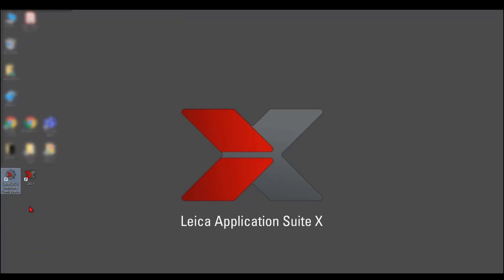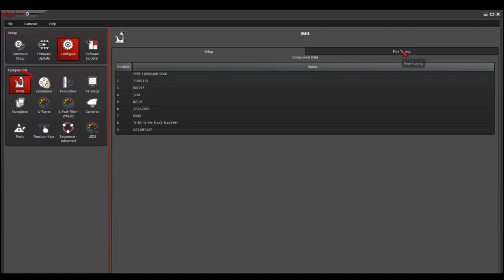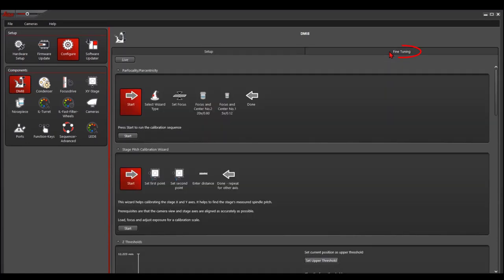To do the parfocal and the parcentric adjustment, we run the LAS X hardware configurator. In the hardware configurator, we do configure, microscope, DMI8, and fine tuning.